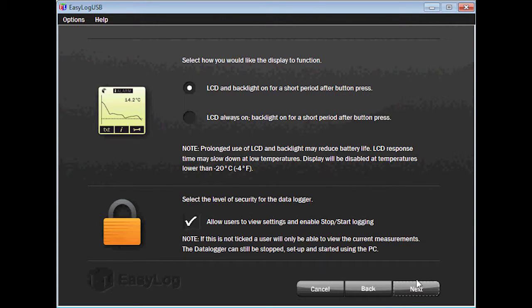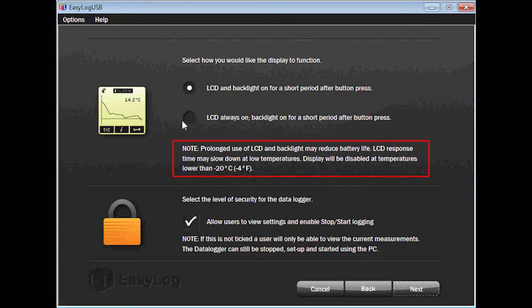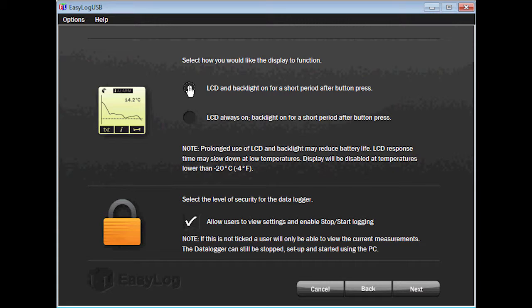Now select how you would like the display to function. You can either have the LCD and backlight on for a short period of time after pressing a button, or you can have the LCD stay on all the time and only have the backlight stay on for a short period of time after pressing a button. Notice the note telling you about the prolonged use of the LCD and backlight. I will keep the default setting of the LCD and backlight staying on for a short period of time.